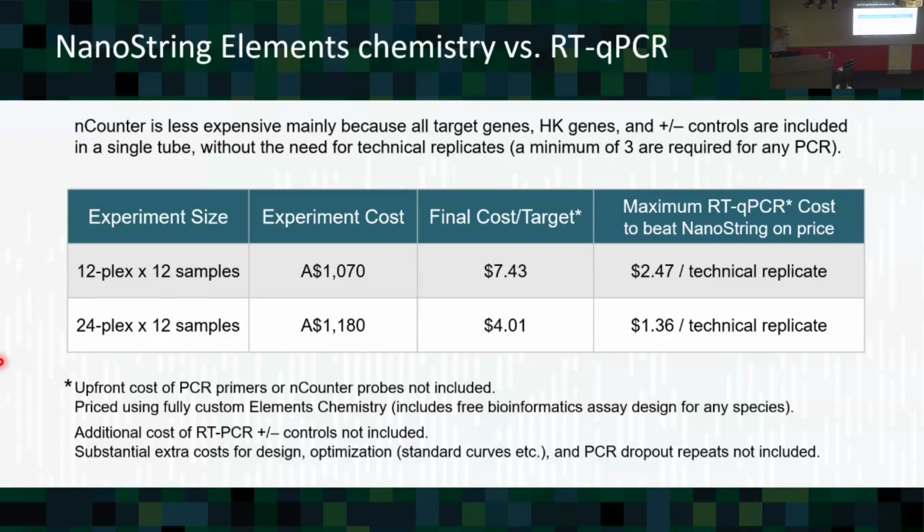And the other thing you can do is, if you bought this and you had only a 9-plex, for example, not a 12-plex or a 7-plex, you can just not design for all the barcodes, and the barcodes that are unused are just ignored. So this will be the low end. This is the worst case scenario here. And even that's not looking too bad, I think. Remembering that you'll get the result very cleanly with a very, very high precision, and no one's going to argue with it. Like Kirsten Worm said, she went straight to publication in the top journals because no one questioned her. Her results were pristine. Whereas, you couldn't make sense of her other data. Does that kind of get to that?